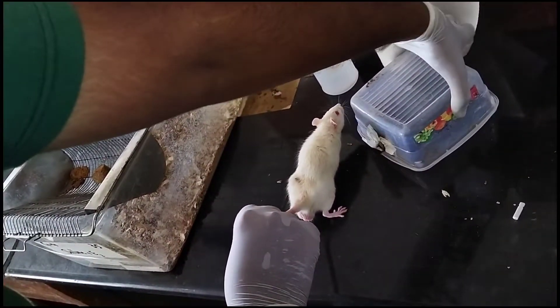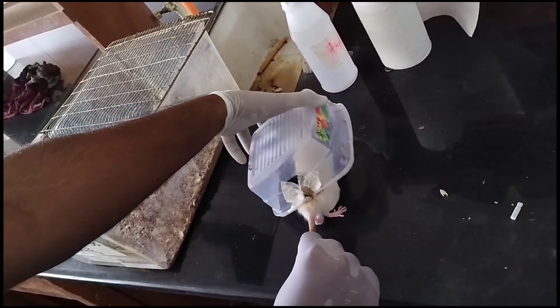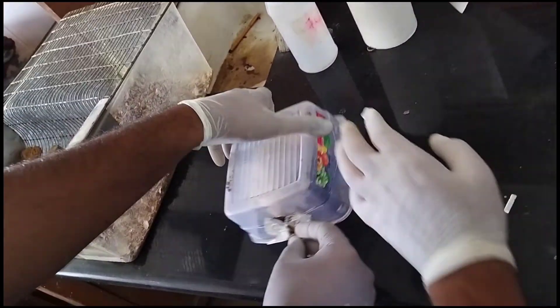Take the rat out of the cage, then put the box over the rat gently, making sure it won't hurt him.